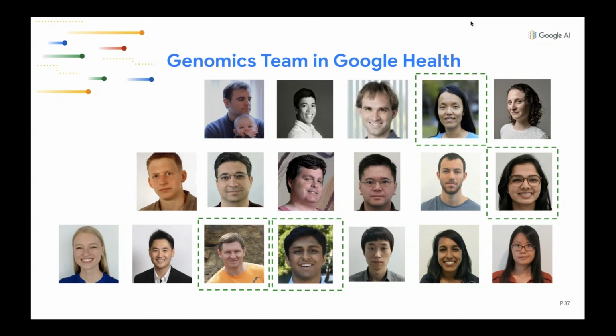Yeah, so we distribute DeepVariant as a Docker image and as a Singularity image. A couple of members of the community have adapted this into Conda installable packages in some form, but I haven't personally gone through the installation experience. So I think it's likely that one of these Conda packages can work. If you have questions about this, you can file an issue on our GitHub. It's watched by our full team. It's also watched by some of the community members who have generated these Conda images. Actually, now that I think about it, I think Billy Rowell, who's at PacBio on the call, may have contributed to some of this. So this would be one of the installable ways, and these images should contain the most recent v0.8, which includes the PacBio model.